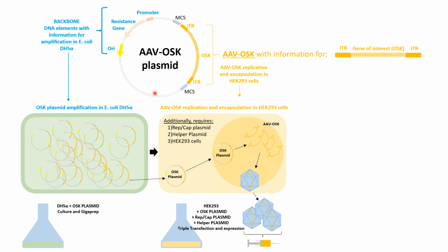Okay, now we have the whole sequence, the sequence that we want, with this first part that is highlighted in blue and this second part that is highlighted in orange. Let's understand what every single part is doing. Remember, I have told you, in the first part we have the ORI, which is the sequence necessary for making many copies of the whole plasmid.